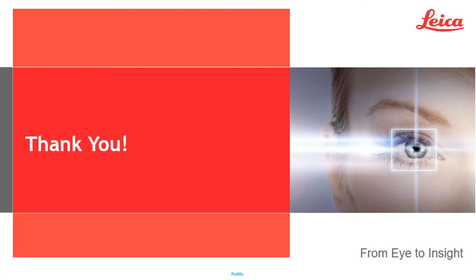So in Avia's particular case, we do not do that. We do not use a PCA. However, I've seen lots of other works that take an additional step forward and utilize the PCA principle to do further processing. So no, in this case, it does not.